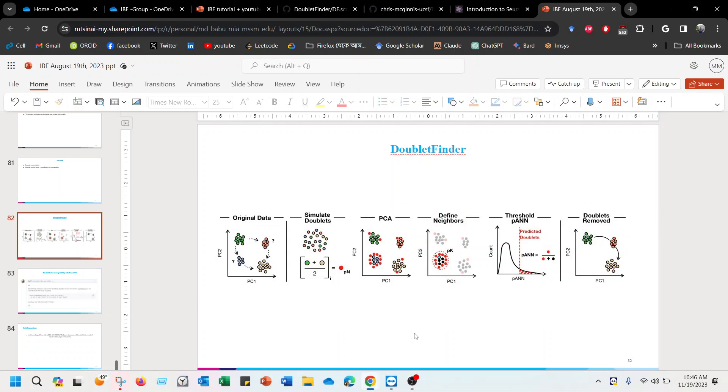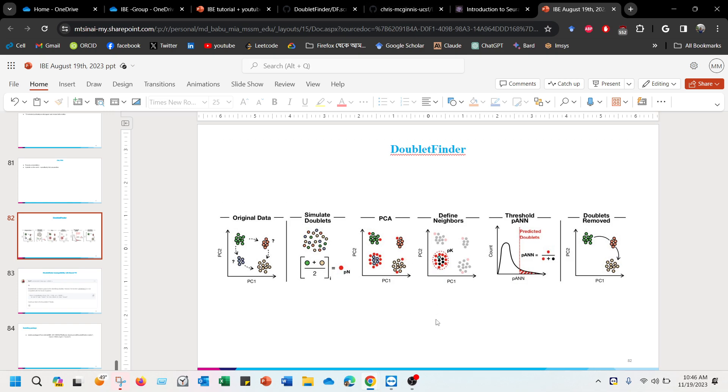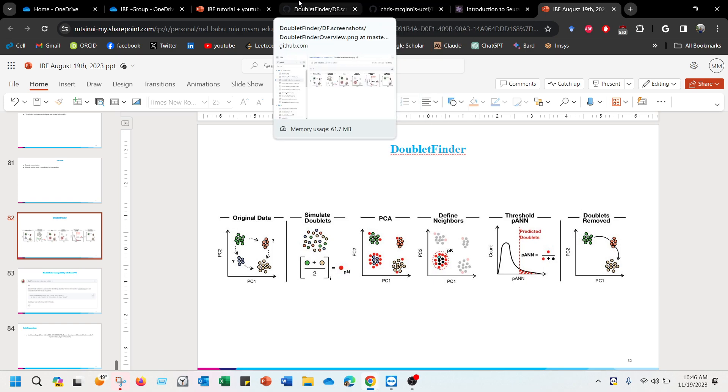If you are doing single cell sequencing, you clearly know that there is an algorithm called Doublet Finder that's used to find the doublets within the single cell sequencing data.